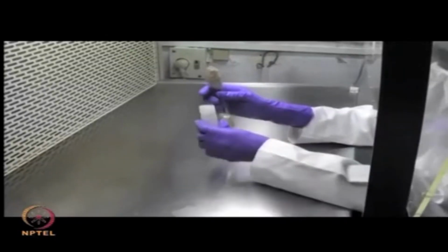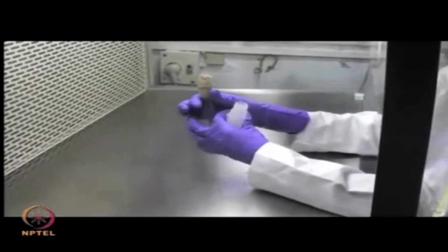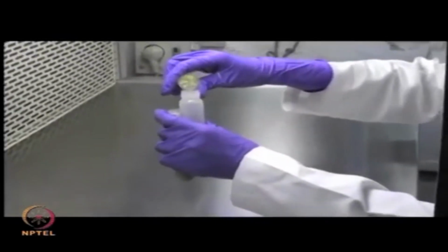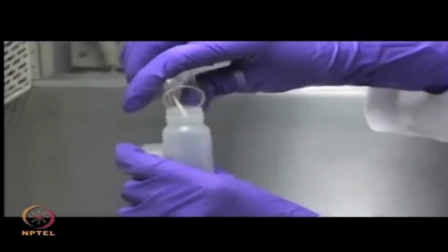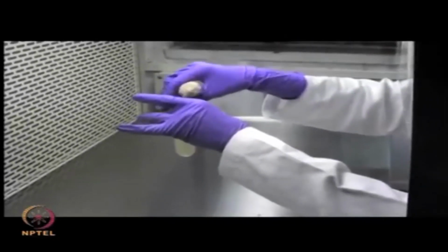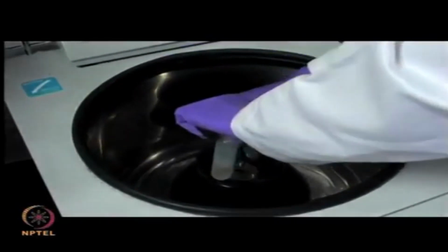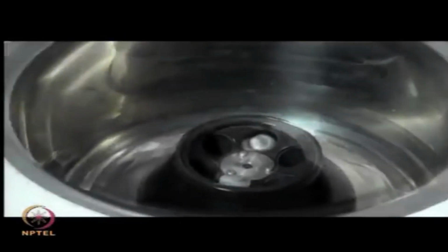Culture harvesting. Transfer the grown bacterial culture to a fresh tube under sterile conditions. Centrifuge this tube at 12,000 rpm for 10 minutes, maintaining a temperature of 4 degrees Celsius.